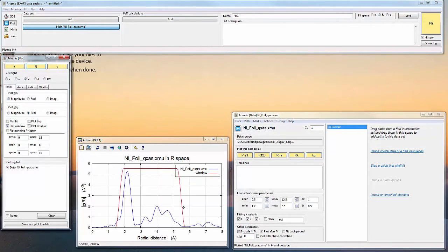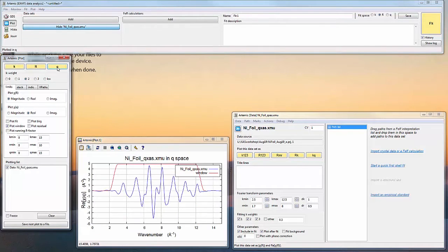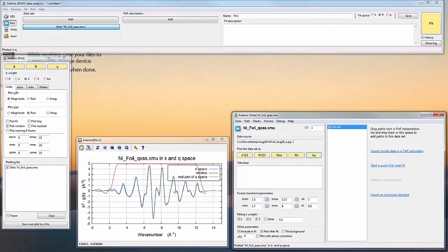And if you wanted to capture those, of course, we're going out really far in R space here. We're not going to fit all the way out here, but this is just to illustrate what happens when you do include more of your R range in your back Fourier transform. Then we can start to see we're capturing some of these shoulder peaks a little bit better. But in general, EXAFS is only sensitive out to about 5 angstroms, and we're doing a back Fourier transform out to 8.